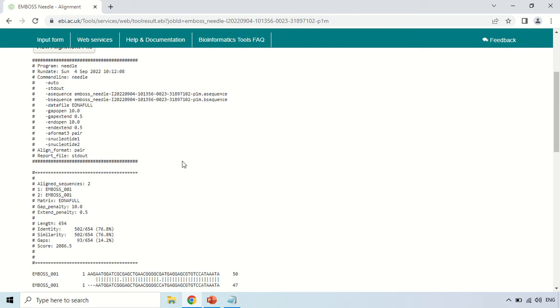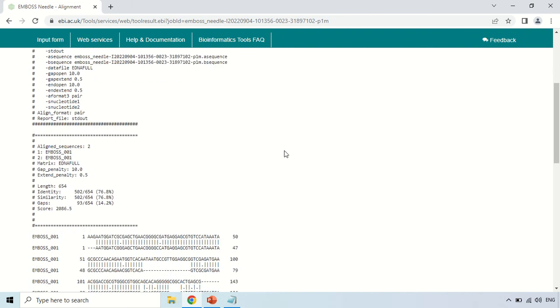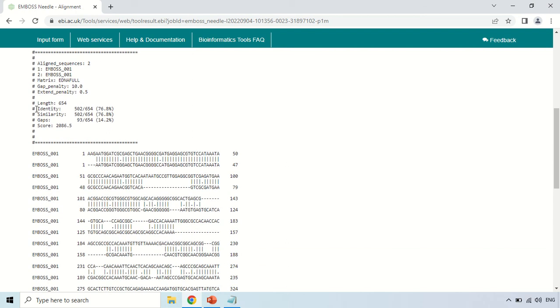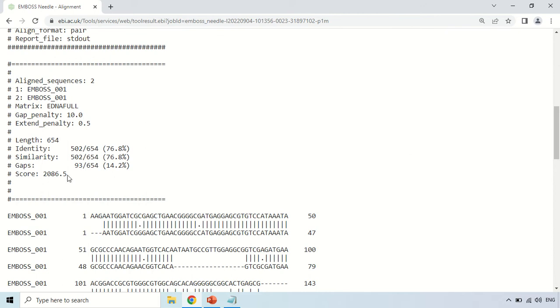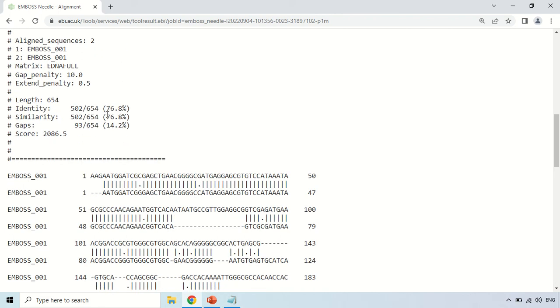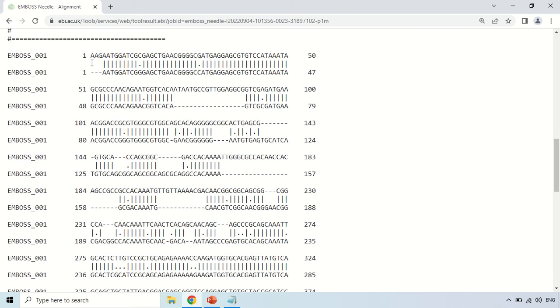This is about the program that is Needle. The program run was Needle, and this is the run date you can see here. Now if you come to the results section — I am zooming in so you can see it clearly — the length of the sequences is 654. The identity among the sequences is 76.8%, the similarity is also 76.8%, and this is the score given to this alignment.